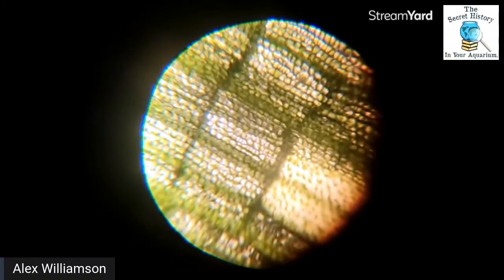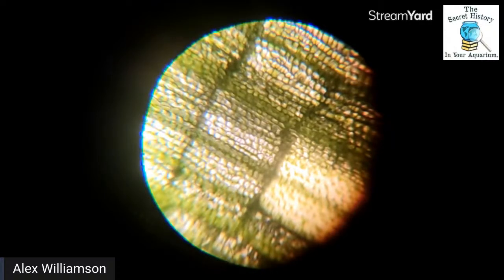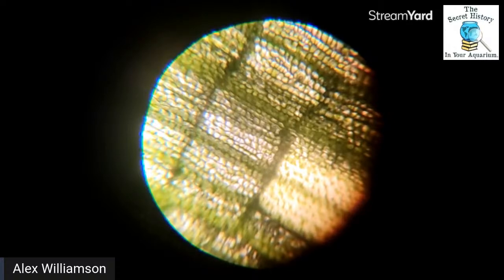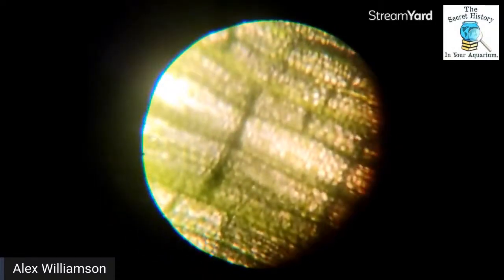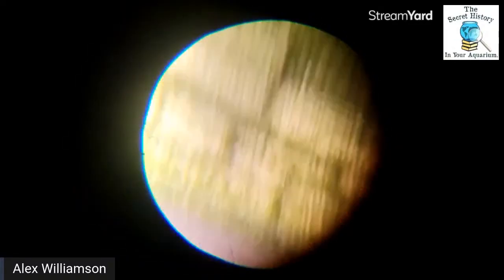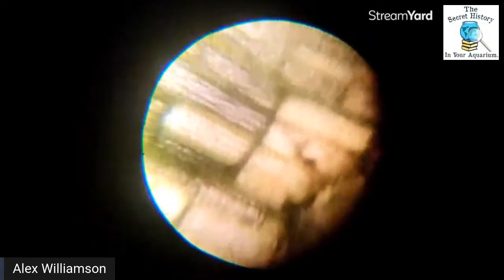All right. So now, take a look at these cells. Now, there's a cell wall for you guys. Perfect little boxes. That's how you tell the difference between a plant cell and an animal cell. Animal cells are gooey. They have membranes, and they move around in their position. They can open, and they can move legs and things. Whereas plant cells are little boxcars. And they do differentiate, like the veins and things may create a pathway. But it's basically like building everything out of Legos still.